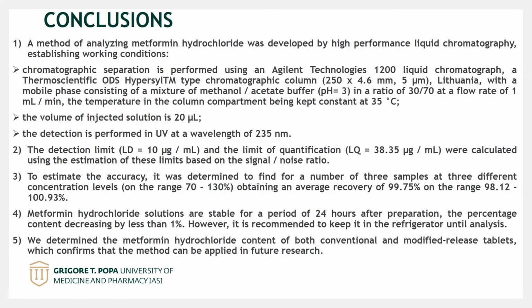4. Metformin hydrochloride solutions are stable for a period of 24 hours after preparation, the percentage content decreasing by less than 1%. However, it is recommended to keep them in the refrigerator until analysis. 5. We determined the metformin hydrochloride content of both conventional and modified release tablets, which confirms that the method can be applied in future research.